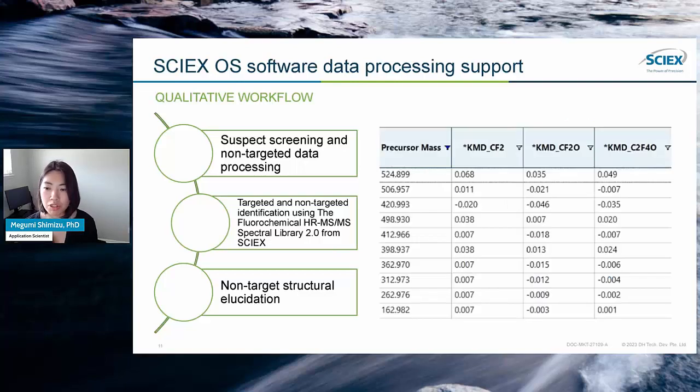You could also use Kendrick mass defect analysis within SCIEX OS. We can use a custom calculation in a processing method to calculate Kendrick mass defect for different repeating units. And we can provide these calculations to help you easily spot some polymer series in the compounds.